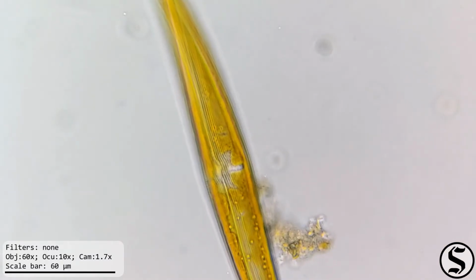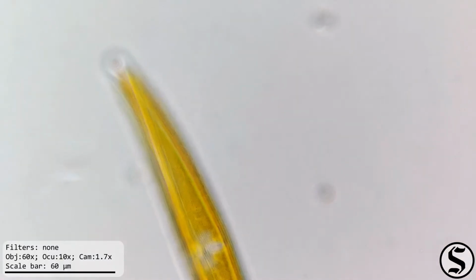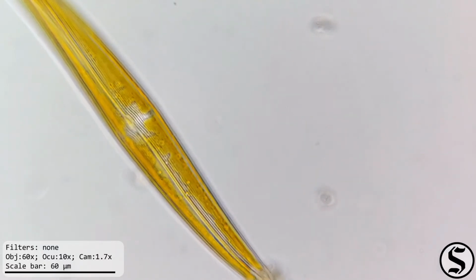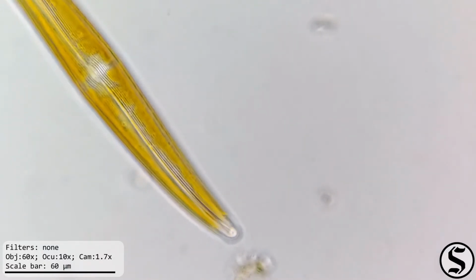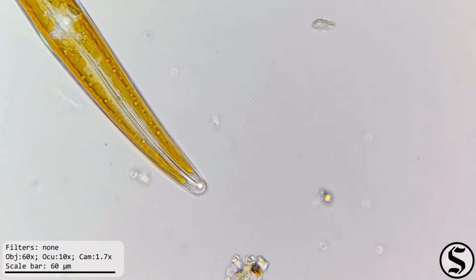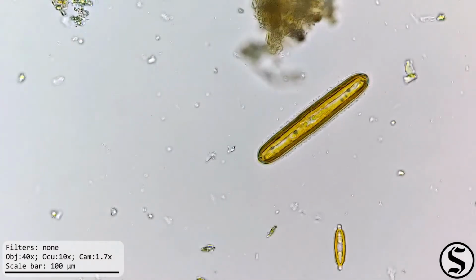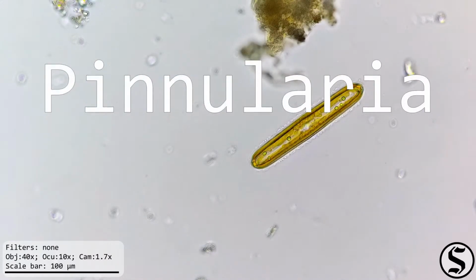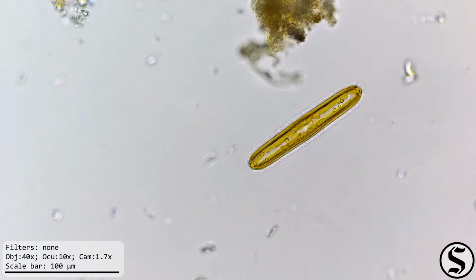Has some really neat striations on that frustule. Even more diatoms. This is of the genus Pinnularia, from the Latin pinna for a pin or peg.